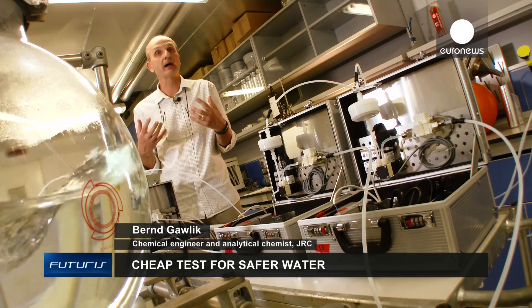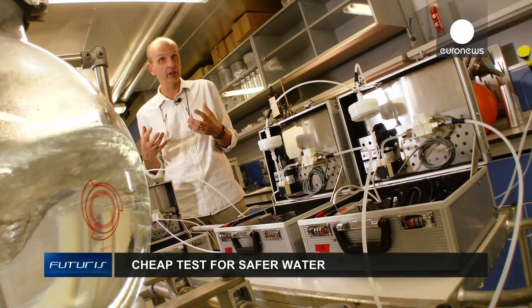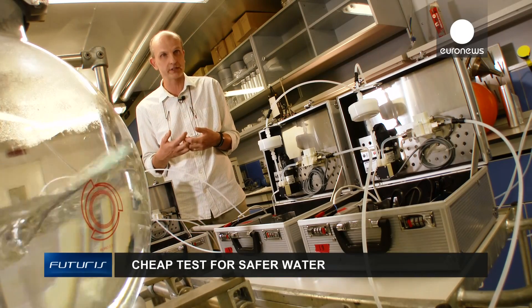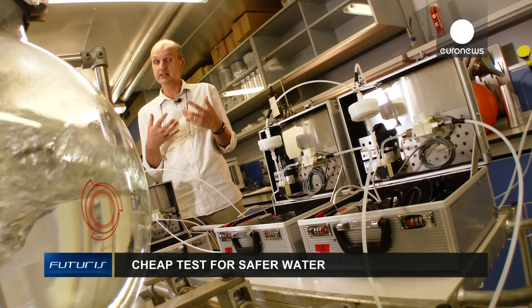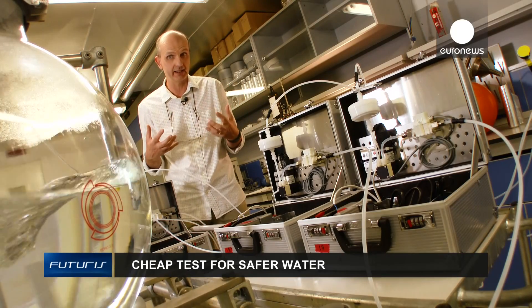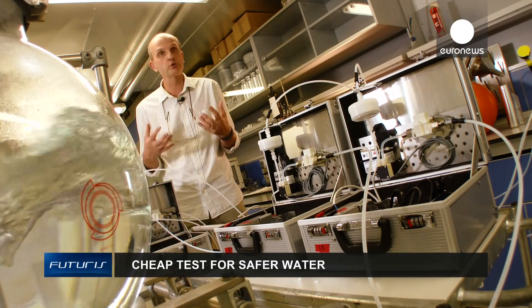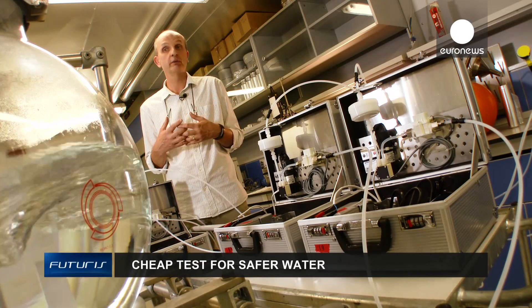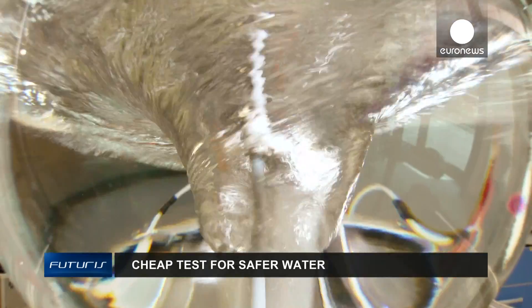Our colleagues are generally amazed with the price-performance ratio. There are so many commercial devices offering similar functions, but they're very expensive. So when they see a do-it-yourself instrument that could cost up to a hundred times less, it's very surprising, especially when they see that they're just as accurate.